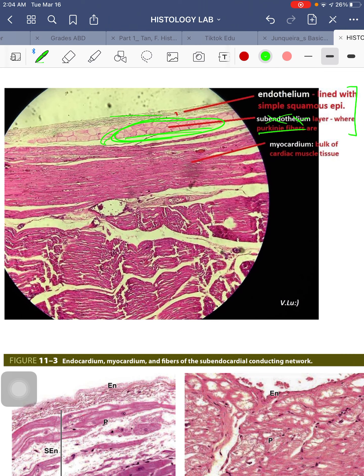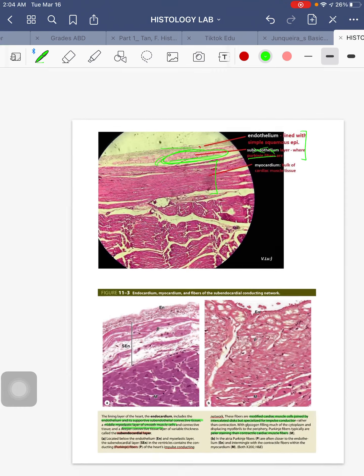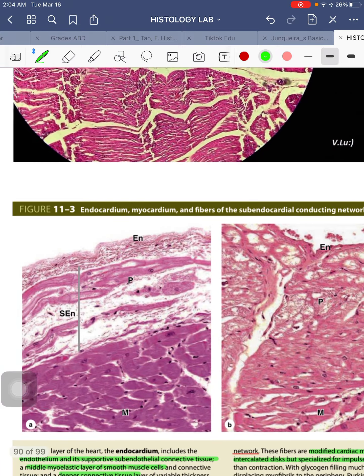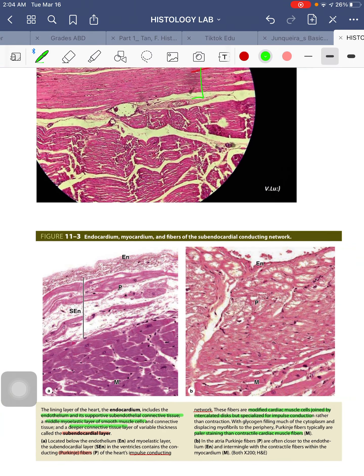The main bulk of cardiac muscle fiber tissue is in your myocardium layer — the middle part. This cross-sectional view shows the endothelium lined by simple squamous epithelium, the Purkinje fibers in the subendocardial layer of your endocardium, and then the muscle fibers in your myocardium layer, which is the thickest layer.